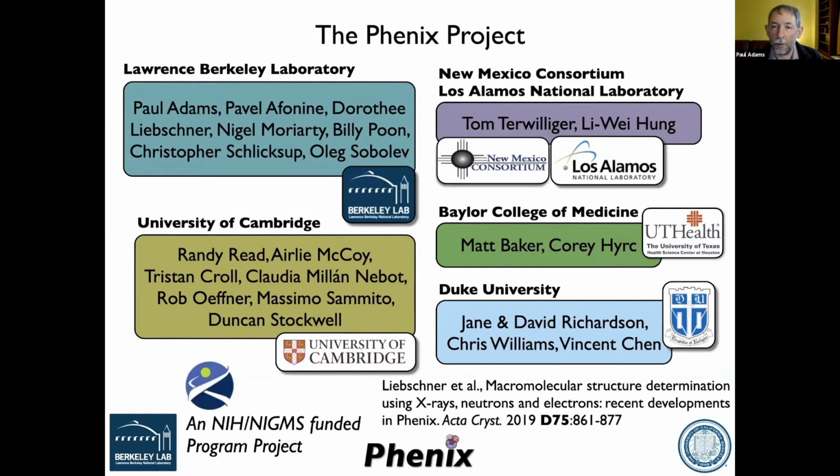You were also saying that there might be no discernible change in the map-model FSC, even if you put them in. Oh, well, that doesn't say anything, but I was just worried that it might throw up something in the map-model FSC. No, if you add a little ligand, or even a large ligand, to a whole huge protein structure, the contribution of that ligand to that FSC will be negligible. So you won't see anything in the FSC. But if you don't see any density for it, you shouldn't put it in anyway, right? That's not reasonable.